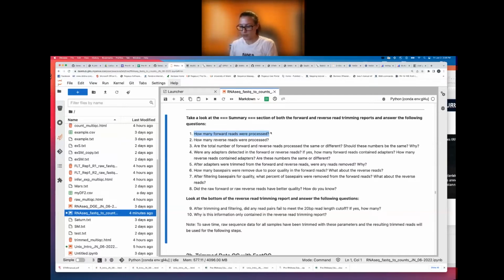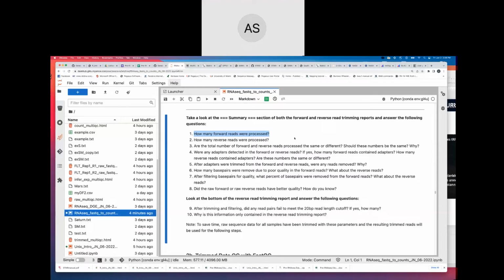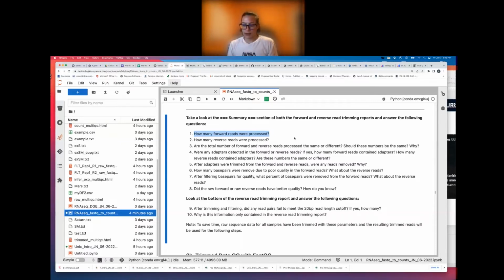So Armin, if you want to release this question, how many forward reads were processed? Yep, it should be up. Excellent. So I'll give you guys up to a minute to answer how many forward reads are processed. Armin, if you see that everyone answers before the minute's up, let me know, because I won't wait if everyone already answered.